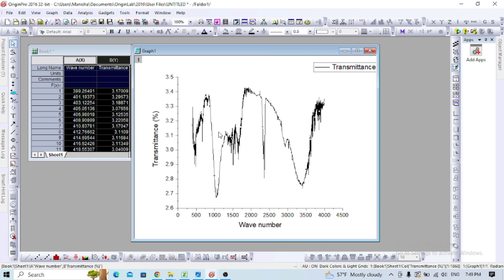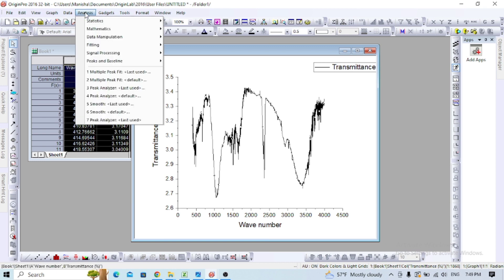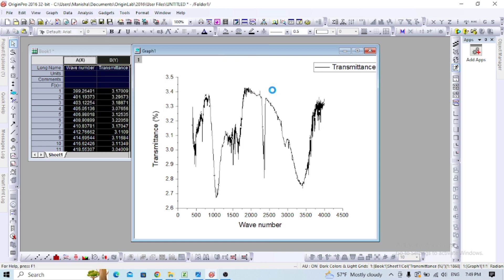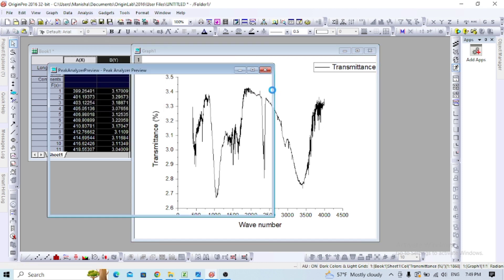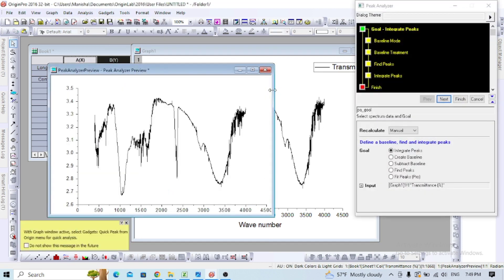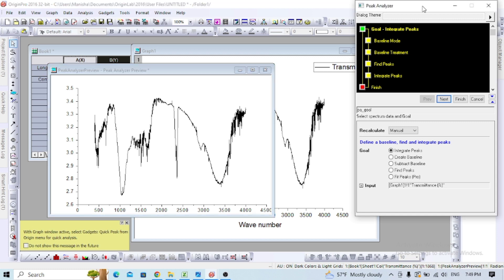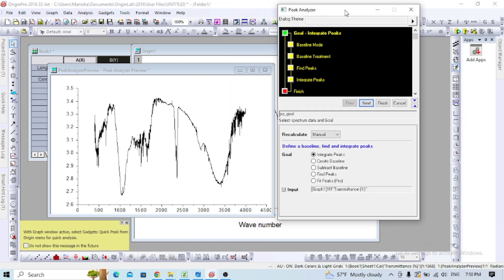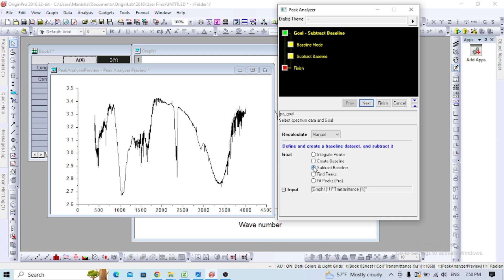Go to the analysis section where you'll see peaks and baseline. Go to peak analyzer and open the dialogue. Now you'll see the peak analyzer section. In the goal section, select subtract baseline.